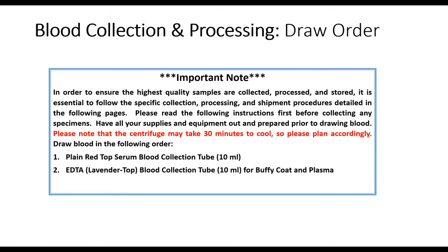There will be centrifuging required. And as I noted, it needs to cool to 4 degrees. And so it can take up to 30 minutes for that centrifuge to cool. So please plan accordingly and get that cooling prior to starting the blood collection so that you can have it cooled in time for processing the samples.